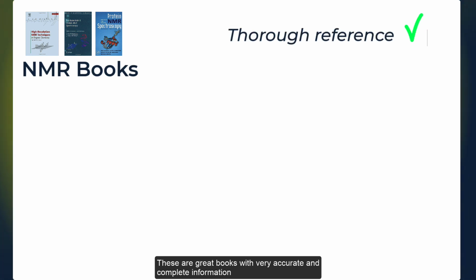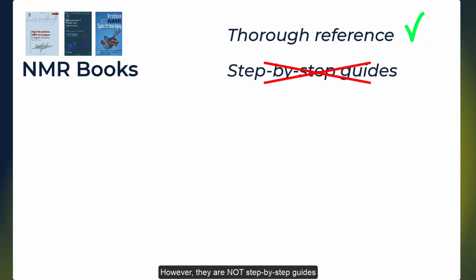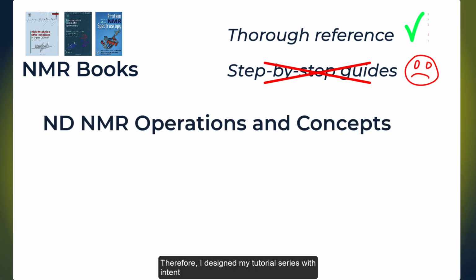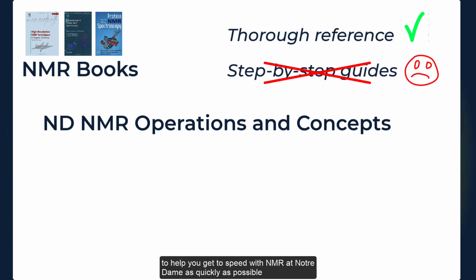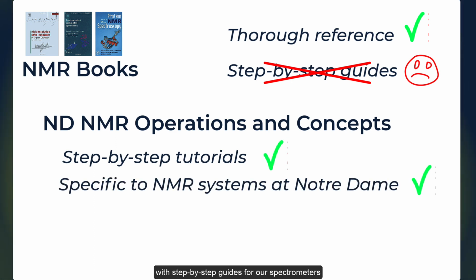These are great books with very accurate and complete information. However, they are not step-by-step guides. They also don't have specifics of the particular instruments that we use at Notre Dame. Therefore, I designed my tutorial series with intent to help you get to speed with NMR at Notre Dame as quickly as possible, with step-by-step guides for our spectrometers.